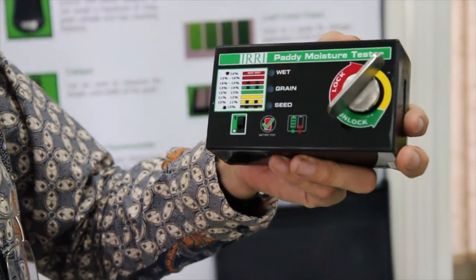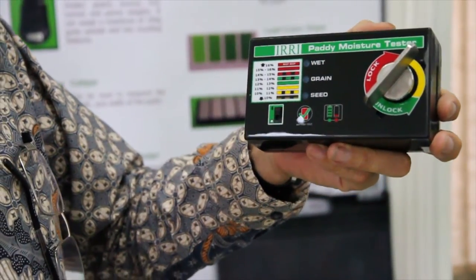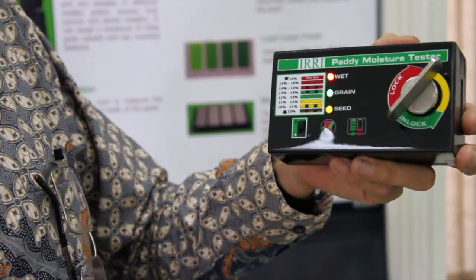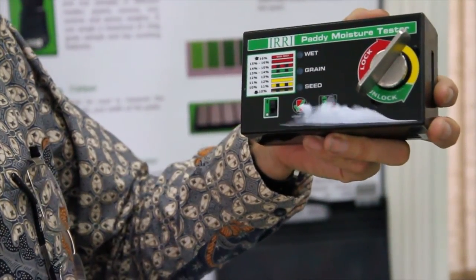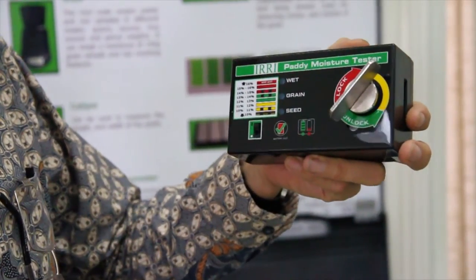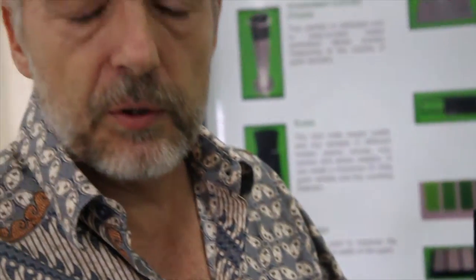The low-cost moisture tester we can currently sell for $55, which is around one-eighth of the commercial moisture meter. And if local production increases in numbers, there's potential to bring down the price to $35 or less. At that price it's within the reach of farmers' groups and cooperatives, and will enable farmers and people in the village to measure moisture content more accurately.